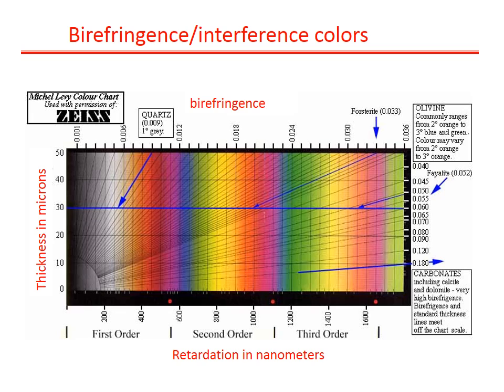And then what about fayalite, pure iron olivine? So that has a higher birefringence with a value of 0.052, which is marked on the right side of the diagram. Again, follow the diagonal back to the 30 micron line, and you can see the retardation is about 1,575 nanometers, and the expected color is third order orange. So olivine can have any composition between those extremes. An intermediate composition mineral might therefore have anything between second and third order orange colors. So spend a few minutes looking at the other examples.